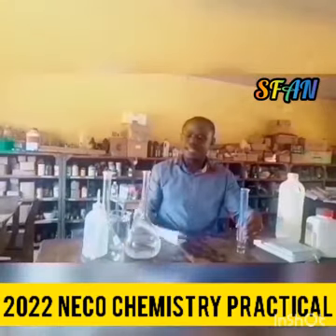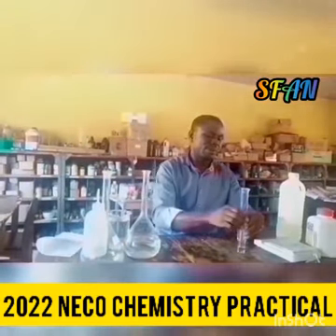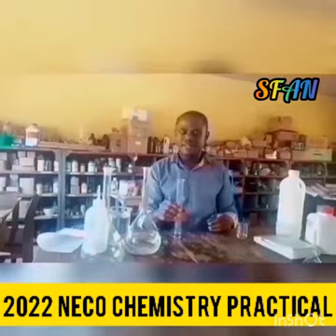Okay, I have here 9.5 cm³ of my trioxonitrate(V) acid.